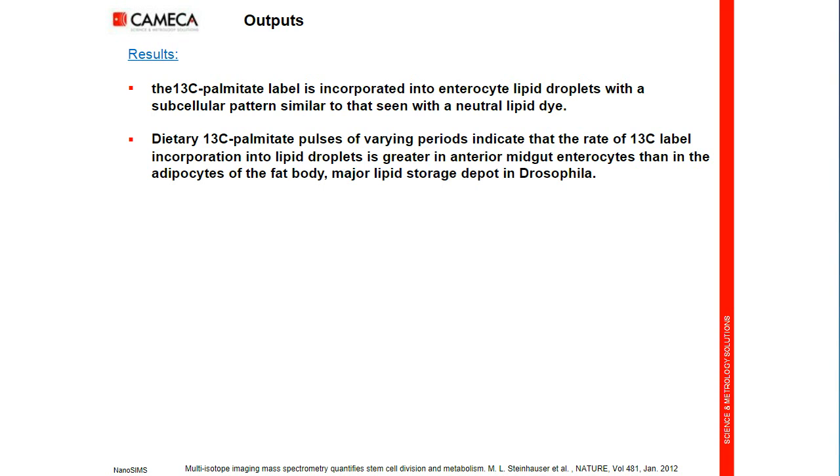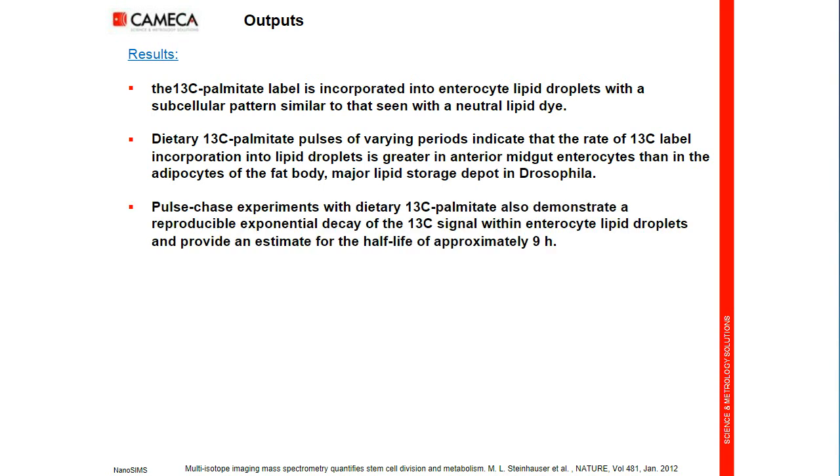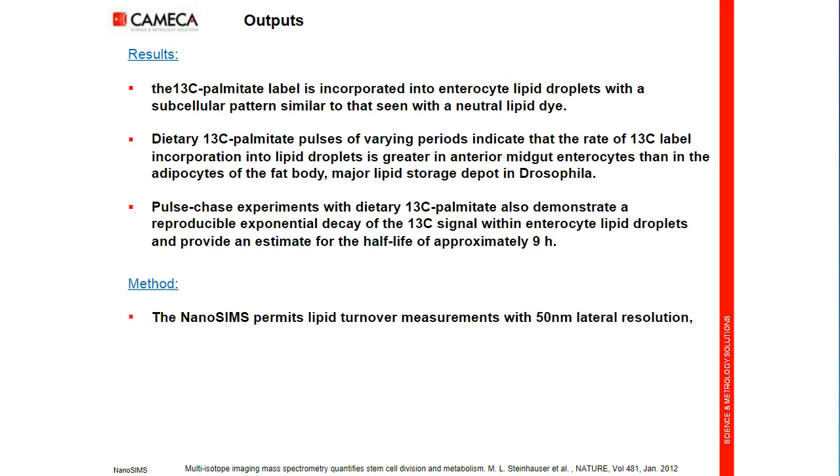And a pulse-chase experiment with dietary C13 palmitate also demonstrates a reproducible exponential decay of the carbon-13 signal within enterocyte lipid droplets, with a half-life of approximately 9 hours. And concerning the methodology, we have seen that it's possible to measure lipid turnover from small areas with 50 nanometers lateral resolution.